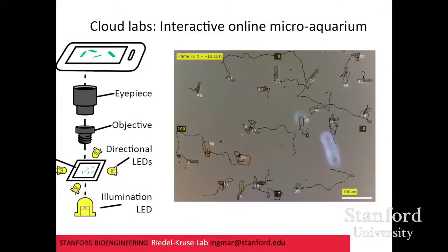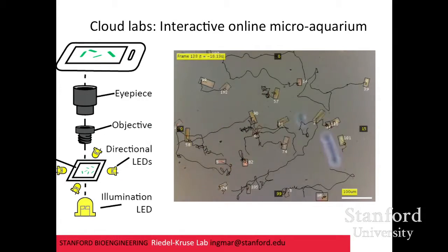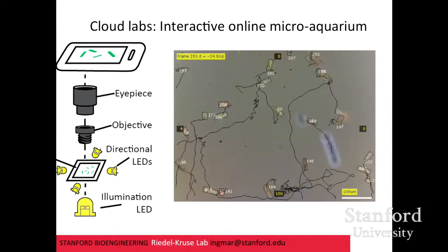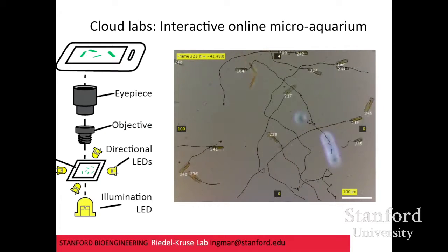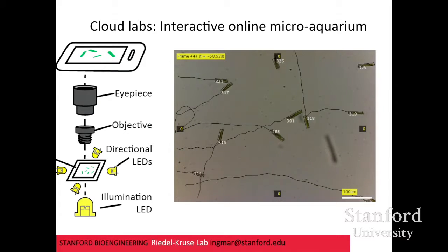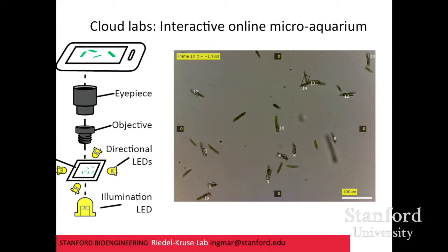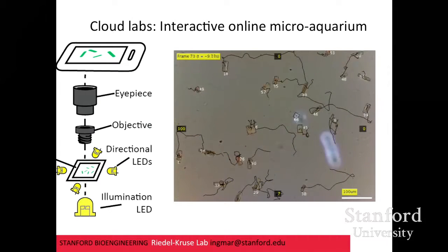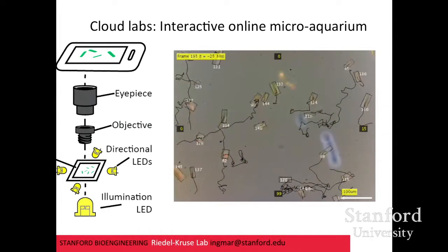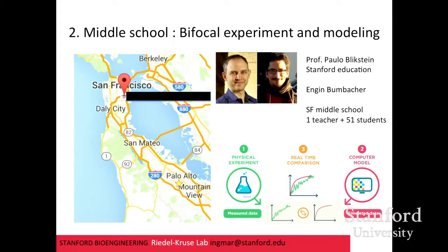Here's after the experiment, you can actually then download the data, and we've written some scripts where the system automatically tracks the cells for you, presents all this track data that you can, for example, import into MATLAB and then do analysis with that, right? So we did a number of user studies with this.